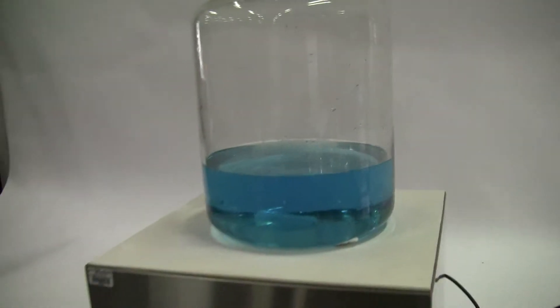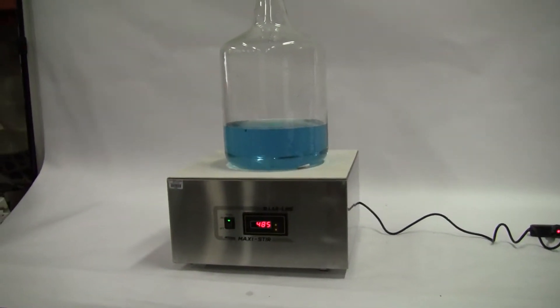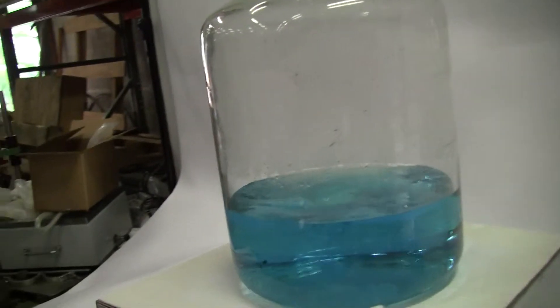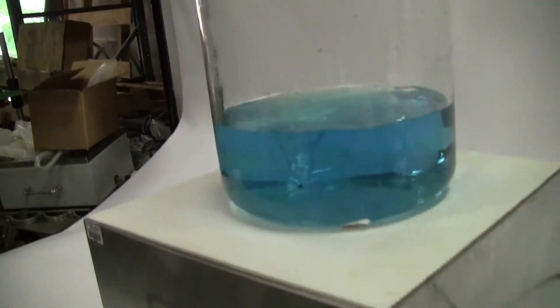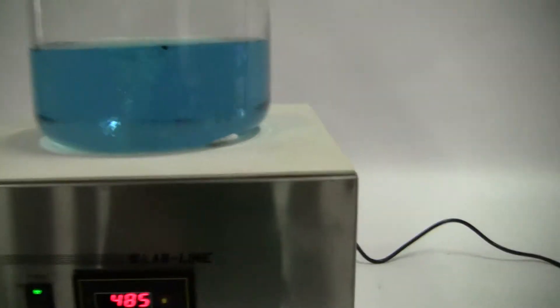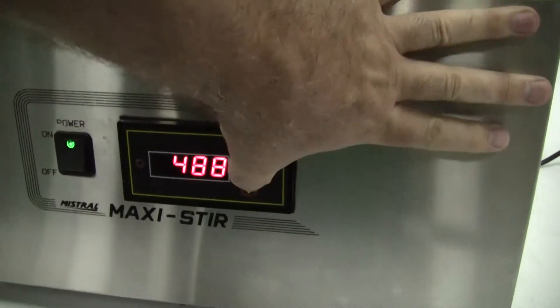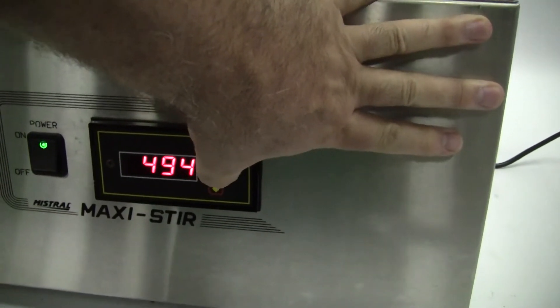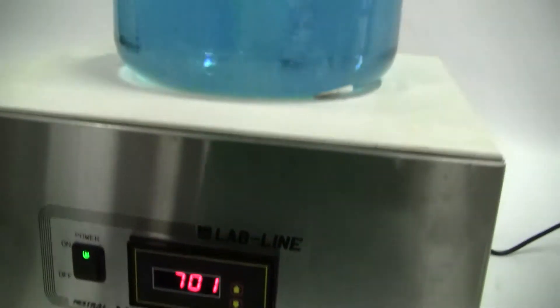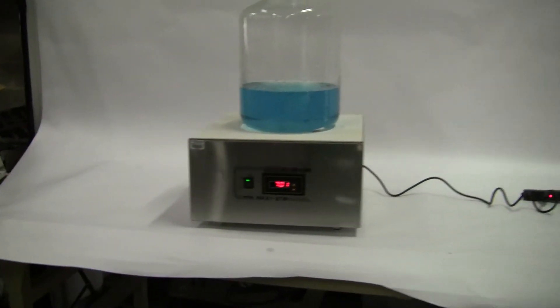Let's turn it on and take a look at it. As you can see, the sample is stirring very nicely. I'll adjust the RPMs. Works very nicely.